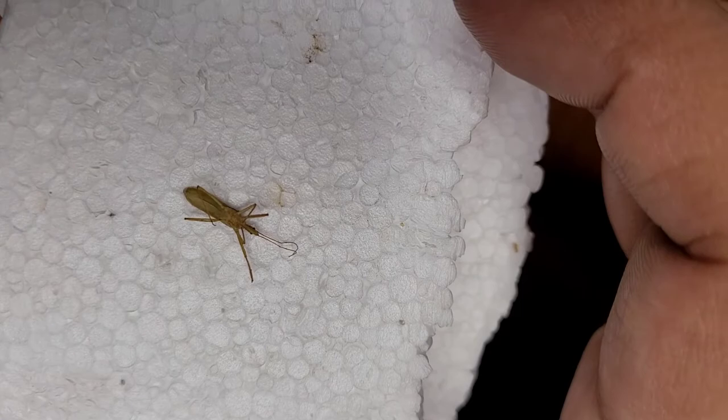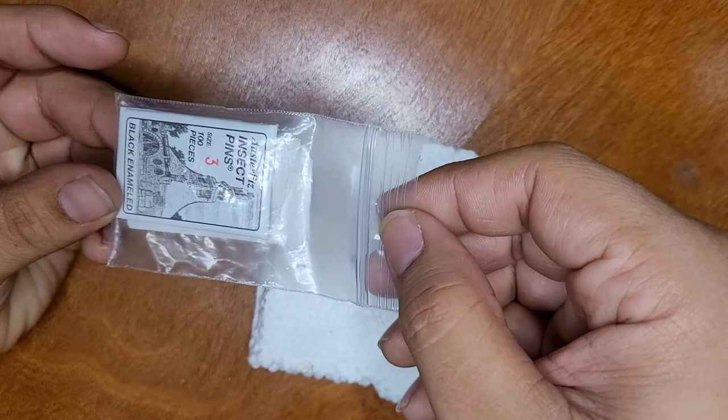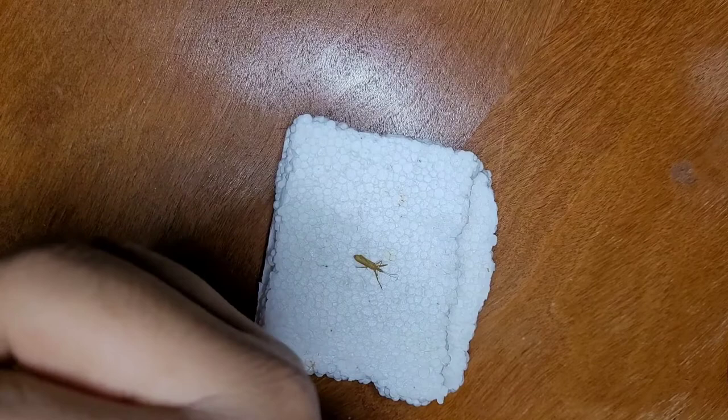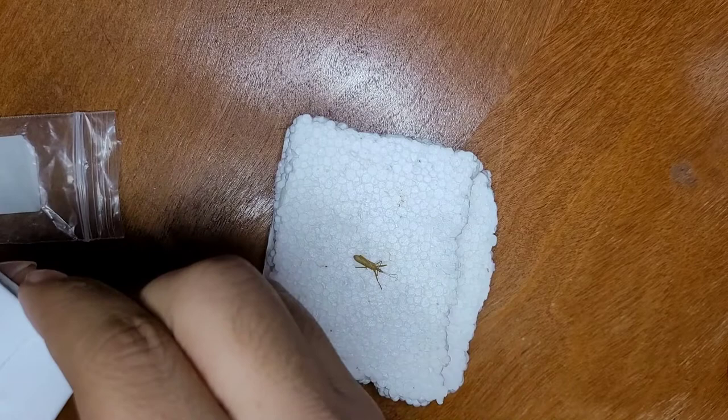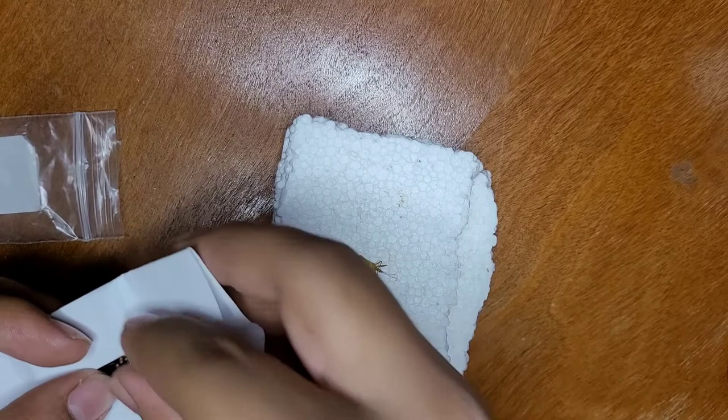Here I'm going to give you a close-up look at the bug we will be pinning. If any of you know insects, you probably already know what this is and would not need to conduct an identification. But for the purposes of this video, I'm going to show you how to do an identification on insects with a dichotomous key. Here are the pins I'll be using — these are black enamel pins, size 3.